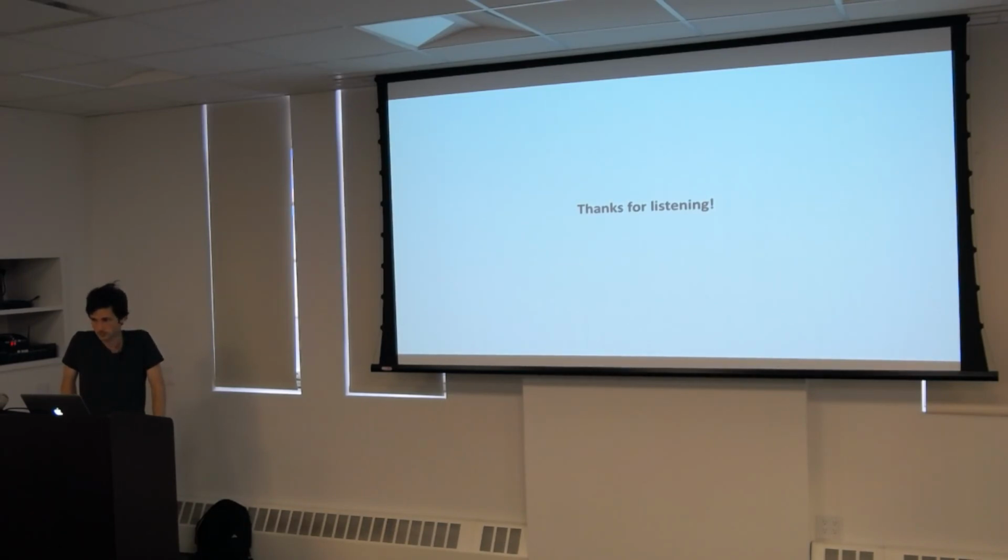How do you know if your resolution is bad just because you don't have enough particles, or because sometimes you don't have the orientations? If you've got a preferred orientation, and you're not filling out all the angles, there's a great program for that from a writer at SEMC called 3DFSC, which you can use to at least analyze whether that's your problem or not. It'll give you a description of the anisotropic resolution limits of your data, and that should be able to tell you if that's your problem or not.